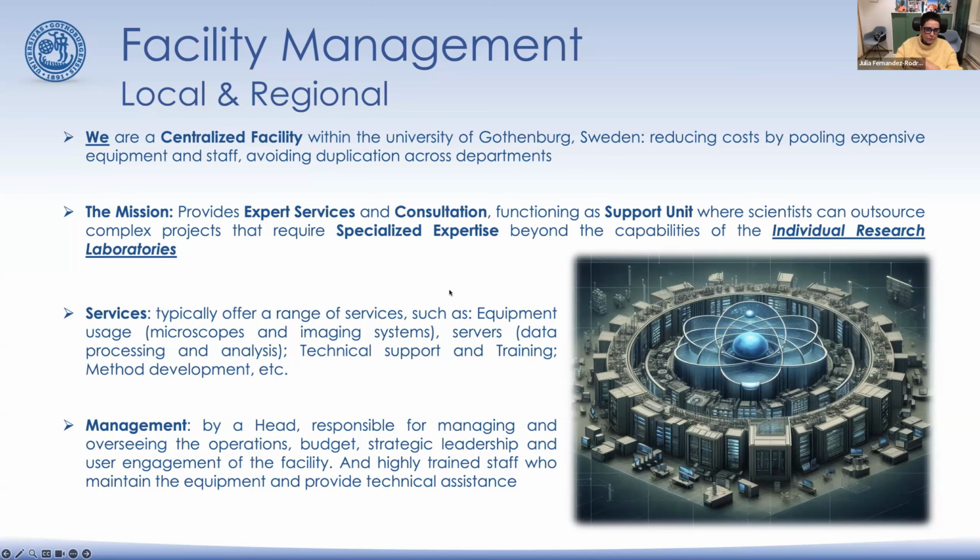We typically offer a different range, as you see, from equipment usage, where we train people. We also have service, and we do data processing and analysis, and of course we can help with technical support and training, and we also do method development, a bit more innovative, in the facility. The management is headed by a responsible person, the head, who in this case is me, overseeing the operations, the budget, the strategic leadership, and also the user engagement of the facility.